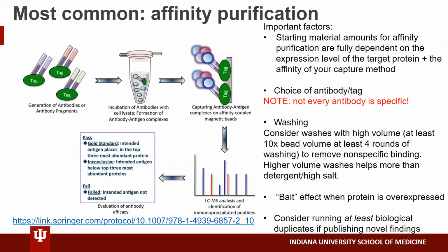And then normally the starting amount of antibody that you want to use is around 1 microgram. You'll see that there's a huge difference in the amount of starting material versus the amount of antibody. That's the kind of ratio that you might want to keep in mind if you're wanting to do a starting experiment to be able to do those titrations. So around 10 milligrams to 1 microgram of antibody. So just that last comment.